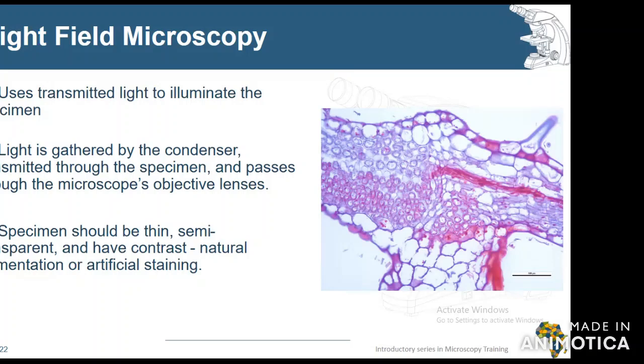A dark object against a bright background, and that is where the name comes from, bright field microscopy. So you view from the top, you have stains that are being employed for contrast, and this shows that it is not a so good method or technique for live cell imaging. So that is one of its limitations.